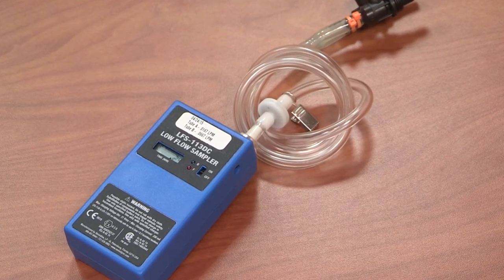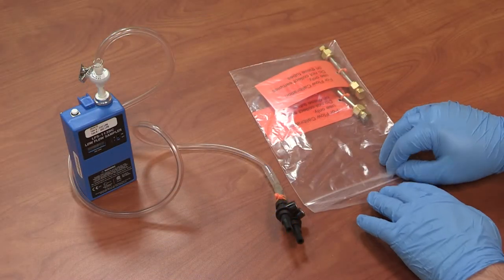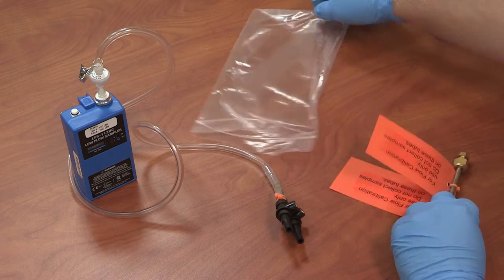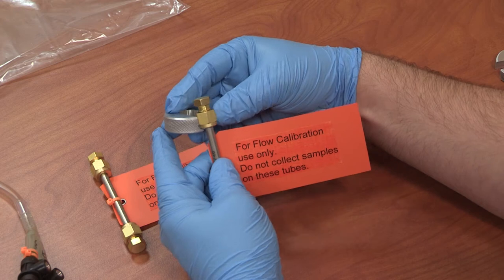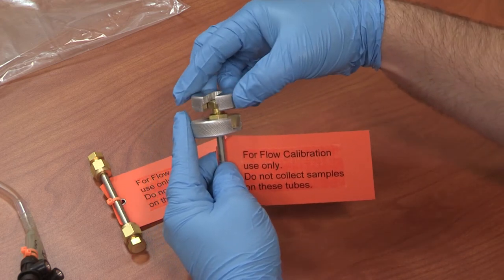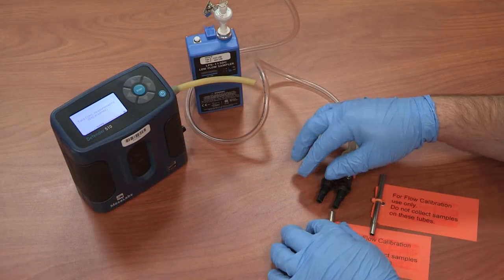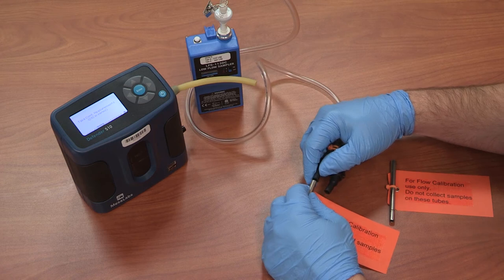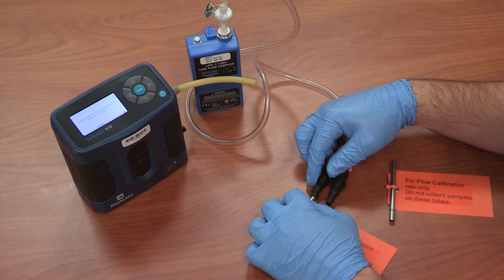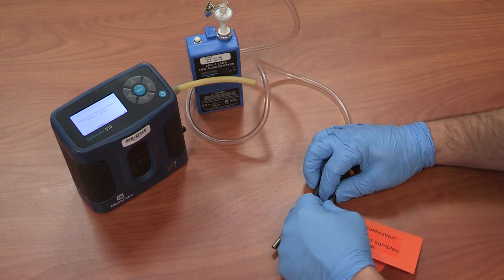Each pump has been pre-calibrated by SGS Galson Laboratories prior to shipping. If you have elected to perform your own pre-calibration, you will perform this step now with the optional low flow calibrator. Remove the calibration tubes from their packaging and use the provided wrench set to remove the Swagelok end caps and connect the tubes to the low flow tubing already attached to the sampling pump. The provided calibration tubes are meant for nothing more than checking your flow rates — these are not to be sampled on at any point.